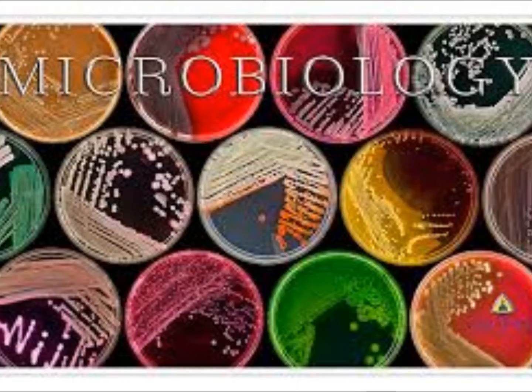So when we're looking at shape, you're going to look to see if it's round, rhizoid, irregular, filamentous, or spindle-like. The margin, which is going to be the actual edge of the colony, is that entire, which, you know, is it a complete colony? Is it undulate, lobate, curled, rhizoid, or filamentous?